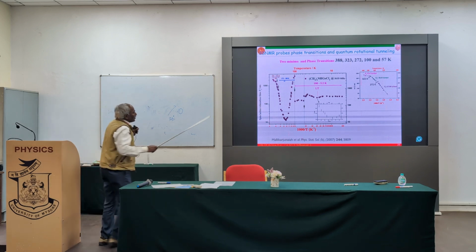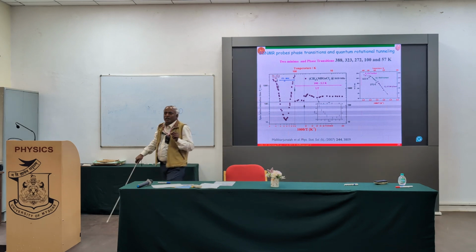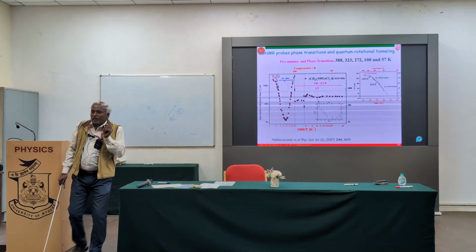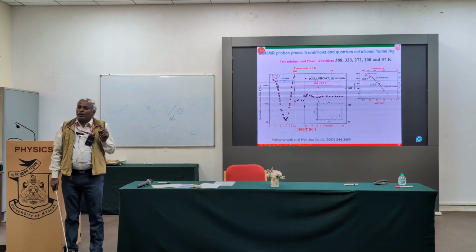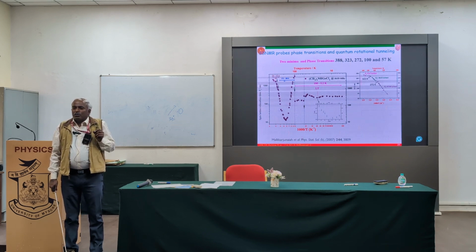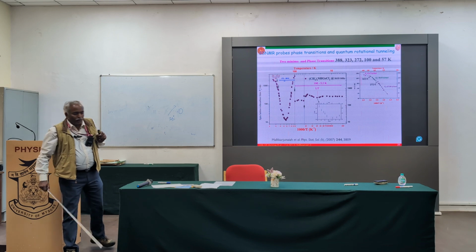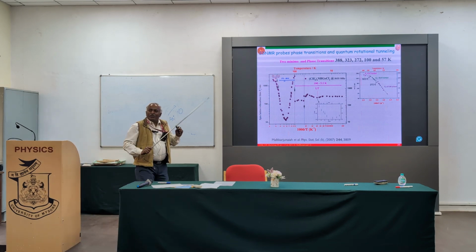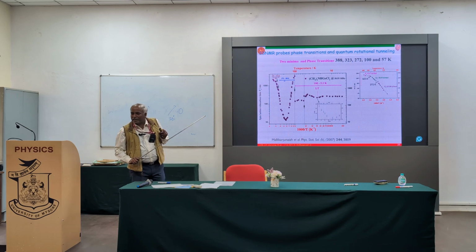Okay, like that to collect this entire temperature range, we have spent a year or so to collect the entire data set. Because lot more things, I have to create the vacuum, I have to go back to very ultra high vacuum, then only I will be able to achieve low temperature. Okay, that's why it is not like the way I showed the spectrum in the morning. In one shot, we don't get this complete data.